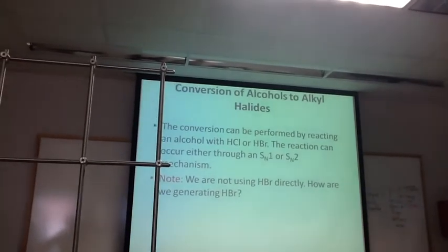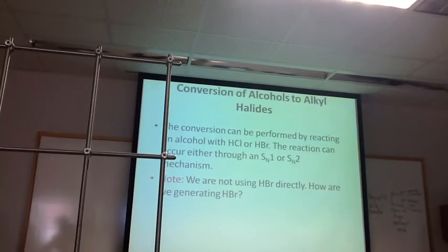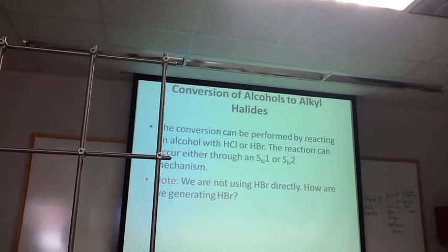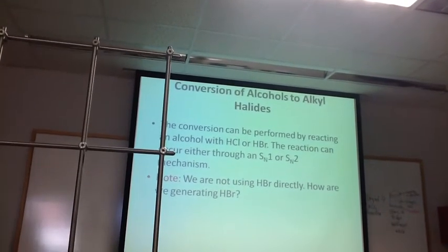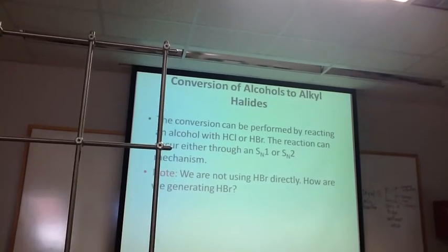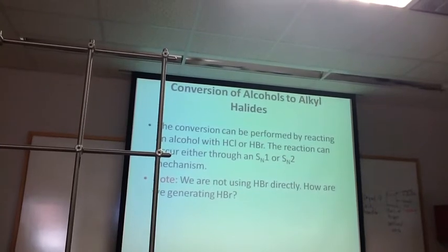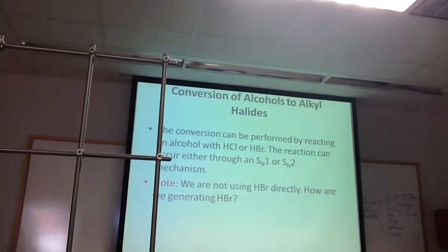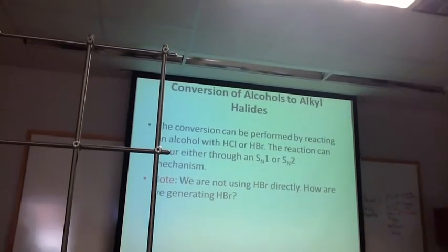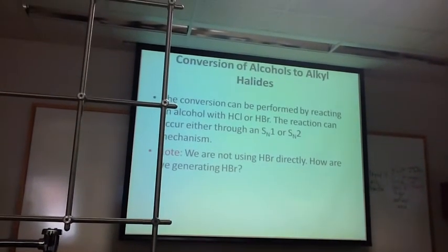Okay, so this is a good note. We're not using hydrobromic acid directly. So can somebody tell me how we're going to generate it in our experiment? Good. All right. So we'll be using sodium bromide today, and you'll be using that to generate your hydrobromic acid. What is sodium bromide going to react with? Mainly sulfuric acid. So make sure you explain where you're coming from by knowing the mechanism, when you're writing it up.